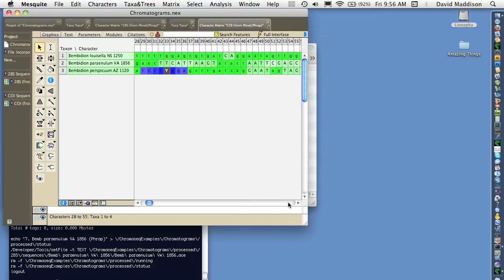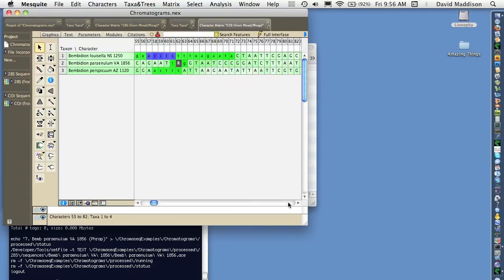Here they are. And the coloring scheme that's used here is one that's related to the quality scores judged by fred and frap, the quality of the bases.